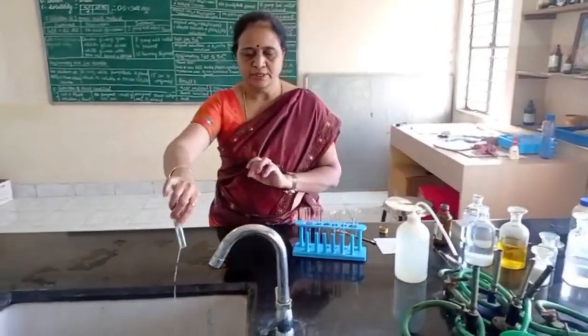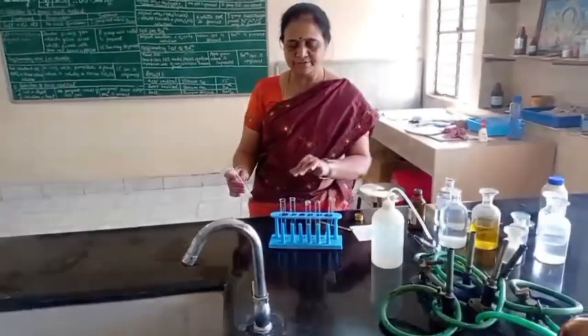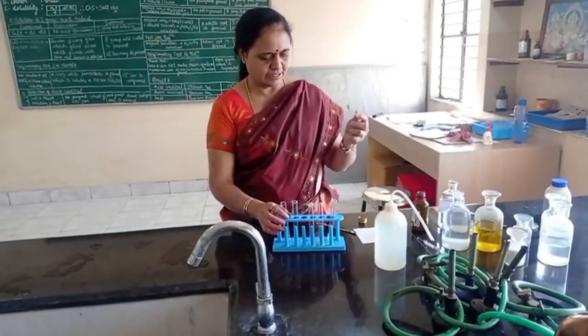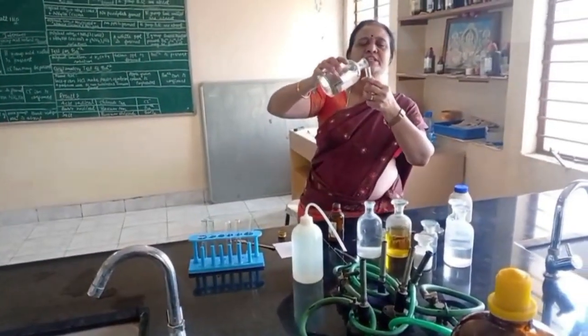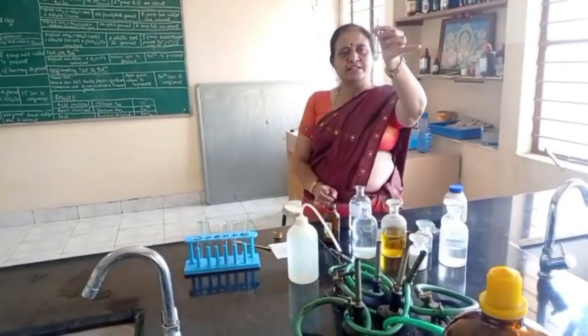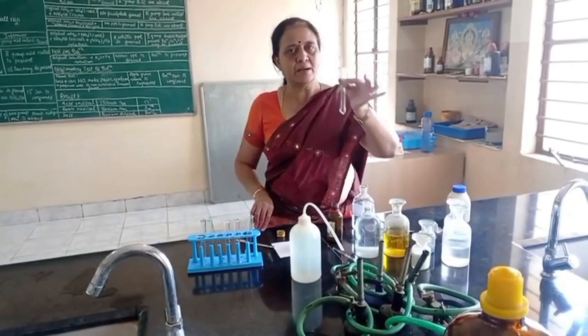Now, I move to detection of first group basic radical. For first group basic radical, I take salt solution. For this, I am adding original solution plus dilute HCl. See here, original solution plus dilute HCl, no precipitate. First group basic radical absent.